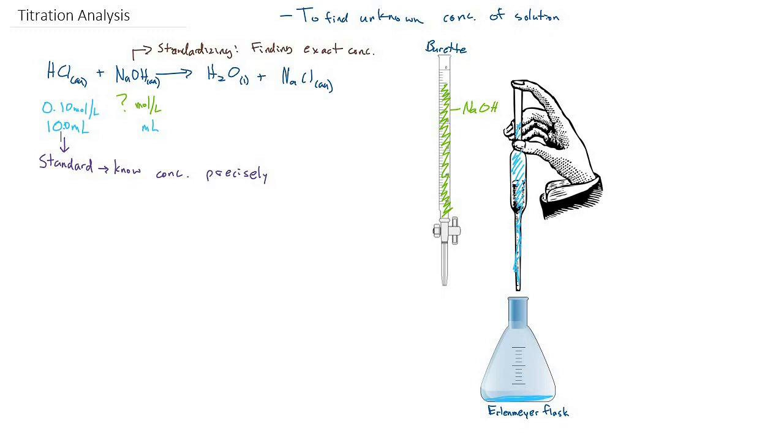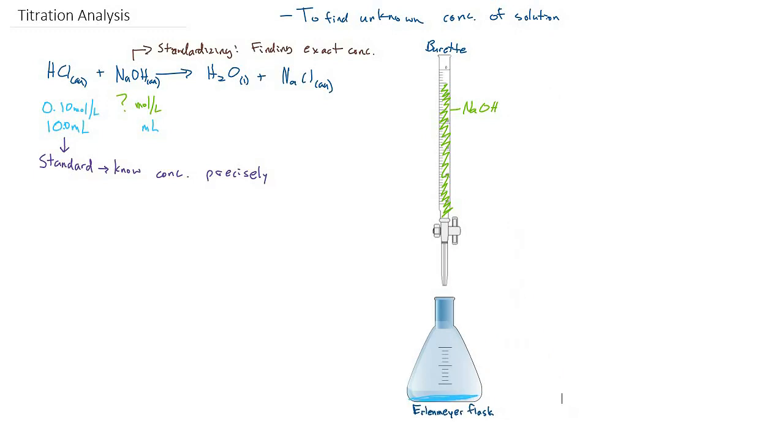So it's going to be a small puddle on the bottom, but we know the amount exactly. So we can say 10.0 ml of hydrochloric acid is in our flask. Now we're done with our pipette, at least for now. So we'll take our flask and put it underneath our burette. And we're going to let some of the sodium hydroxide flow out of the burette into the flask. When it does that, it's going to react with the hydrochloric acid we have in the flask.